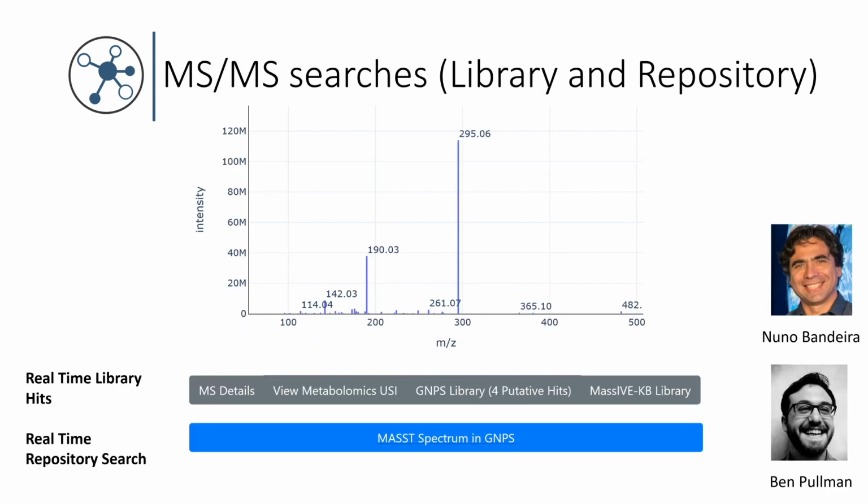And also, very naturally, when you're exploring untargeted mass spectrometry data, you look at MS/MS spectra. And if you look at MS/MS spectra within the GNPS dashboard, one of the cool things that was added in was the ability to integrate with real-time library search across GNPS libraries, across proteomics spectral libraries, and pretty uniquely across all public data out there ever.